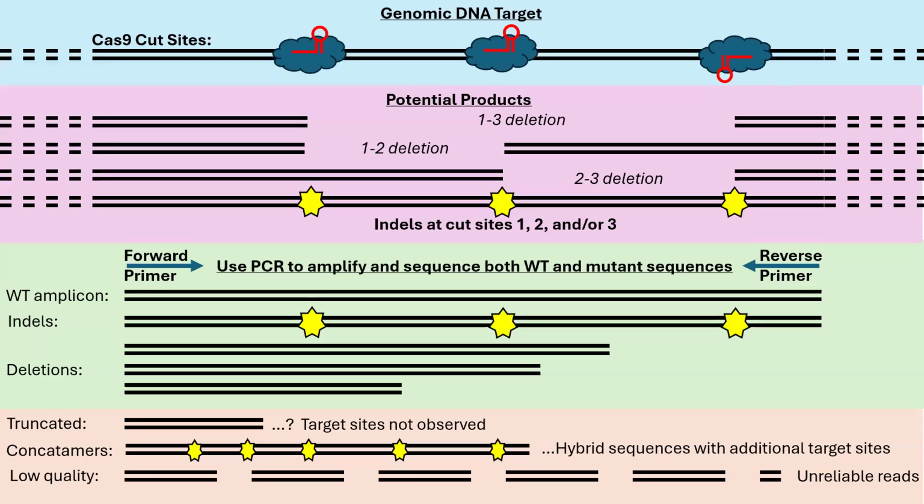Hello everyone. In this video, I'm going to show you one way in which you can determine the knockout efficiency from a Cas9 mutation experiment using nanopore sequencing and tools that are built into Galaxy. Now, before I get started, there's several caveats to mention here. First of all, nanopore sequencing is error prone, so we should not expect these results to be perfect or even that highly quantifiable. But it should give us overall a rough idea of how many of our target sites have been modified and how.